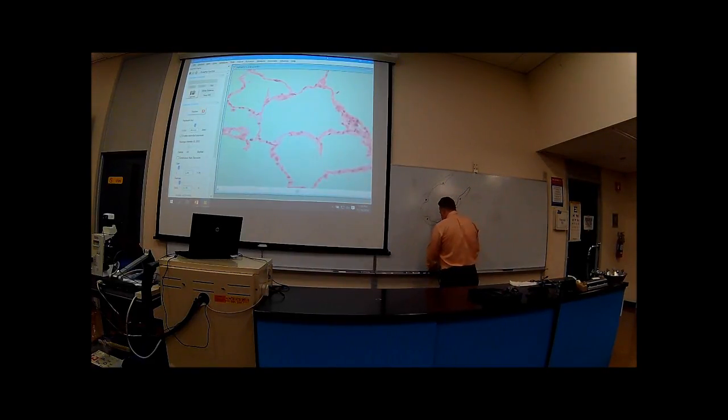So riding alongside each alveolus, okay, probably right over here, is something that's going to be your blood vessel. And it rides along here. And what type of epithelium do blood vessels have? Good. Also, simple squamous epithelium. I'll show you why.